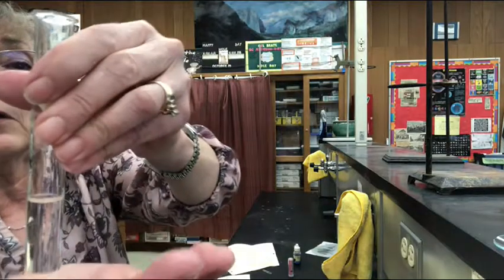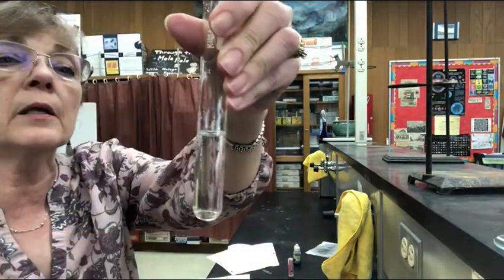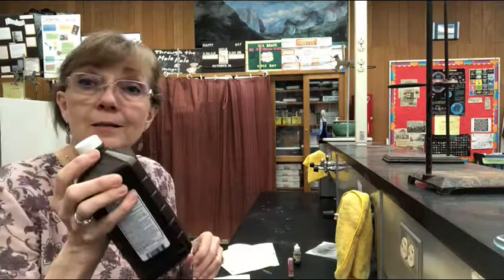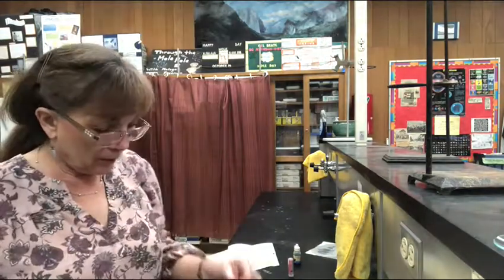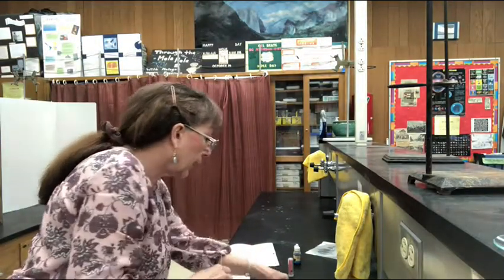If we sat here for a long time, we might notice some bubbles forming. I'm not really seeing anything going on. One other thing to mention about hydrogen peroxide, it's photosensitive. So it's always stored in these brown bottles where sunlight can't speed up the process. But we're gonna speed up the process using a catalyst.